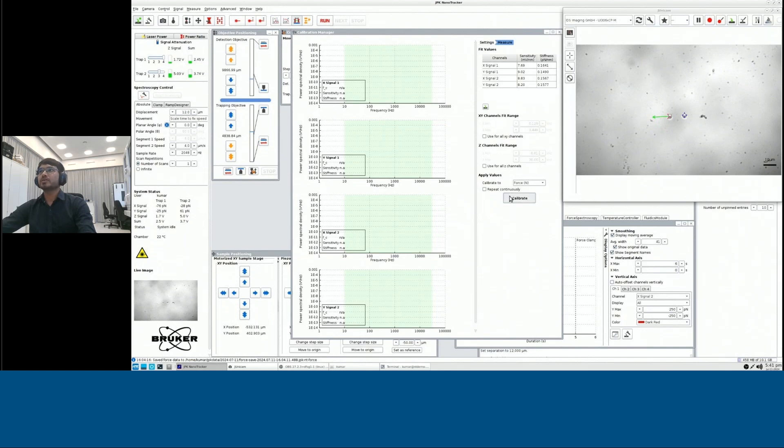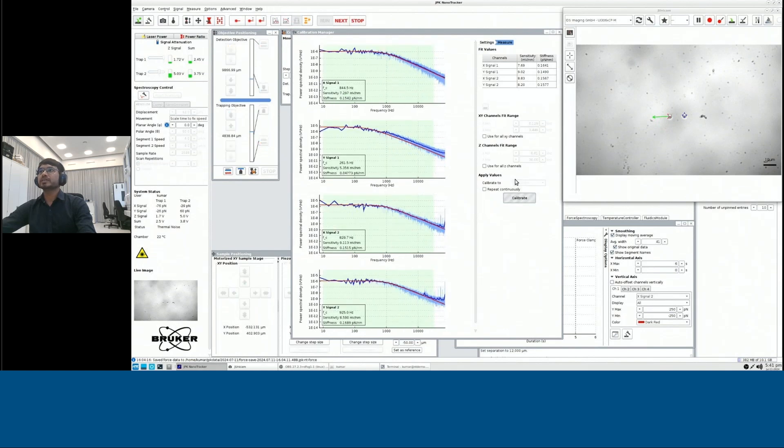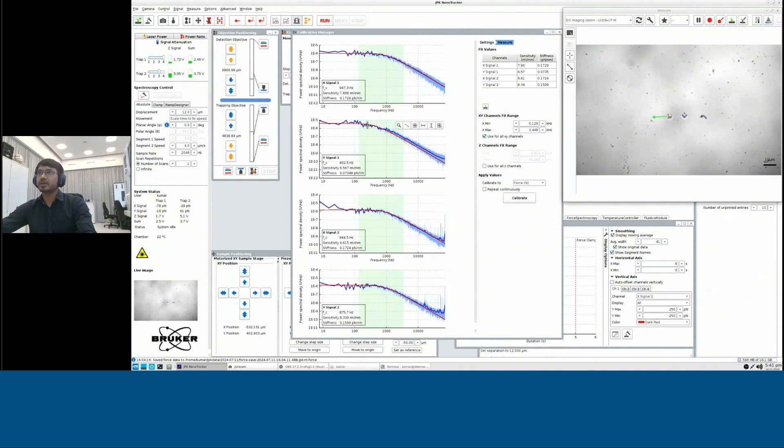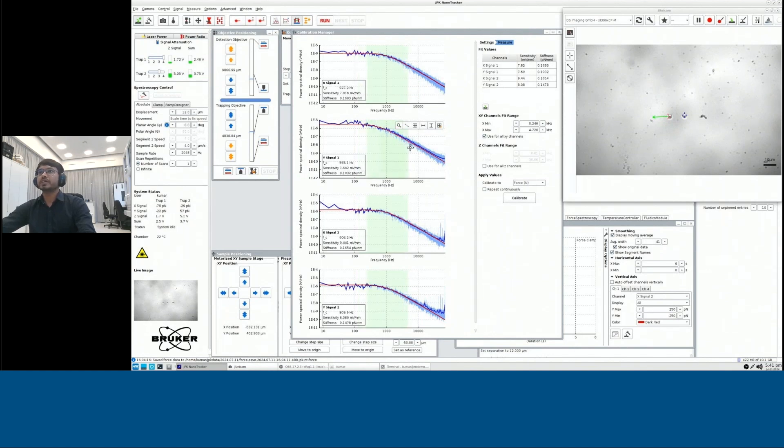So this is how typically power spectrums for a trap look like. You could see the green region is basically the region where you are fitting it with a Lorentzian function. You could select different regions to have a very good fit.